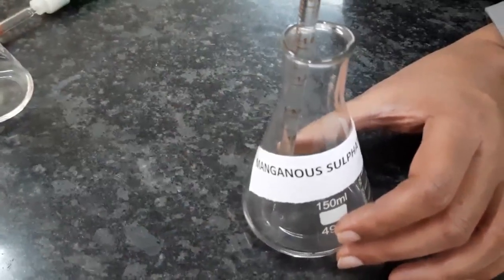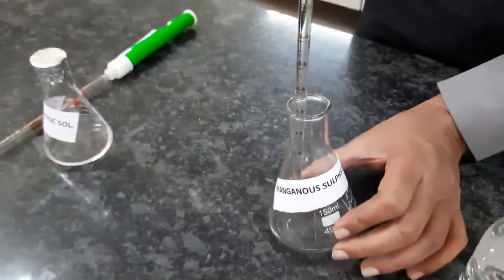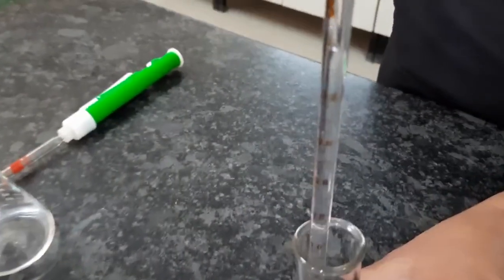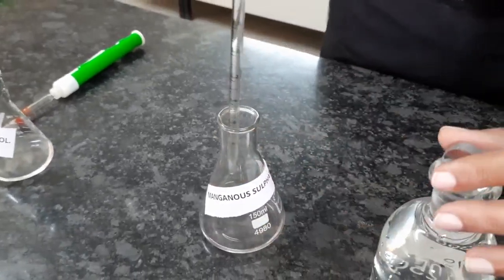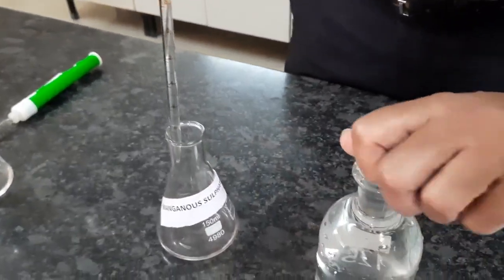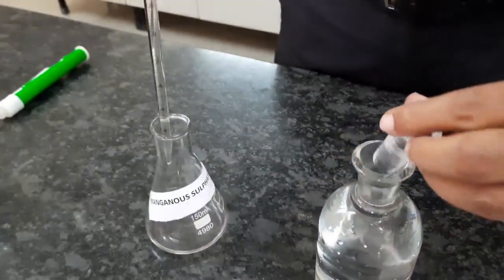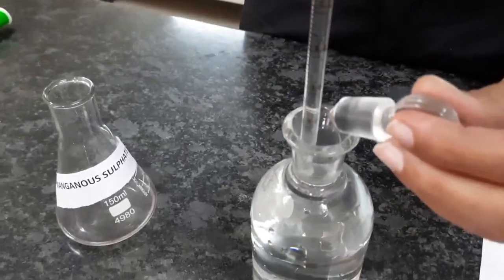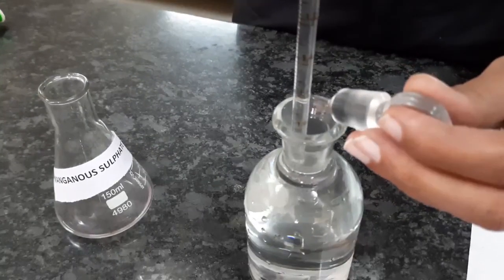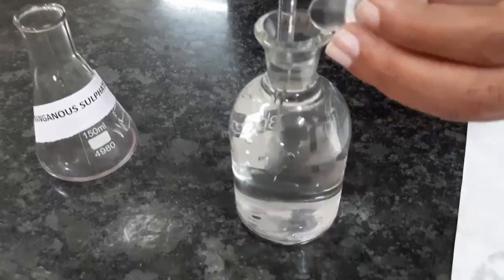The first reagent we are going to add now is the manganese sulfate solution. 2 ml of the solution is added into the BOD bottle. The pipette has to be introduced into the water and you release the solution into the water.